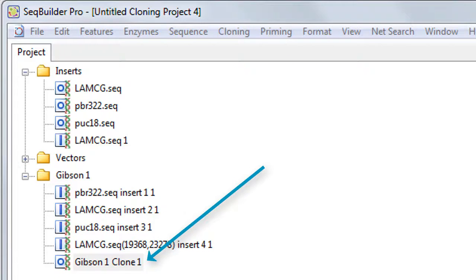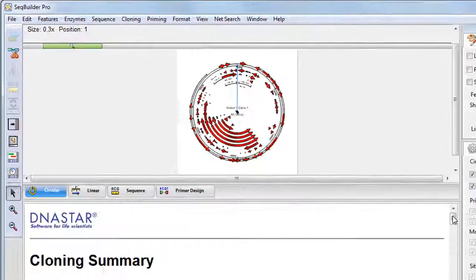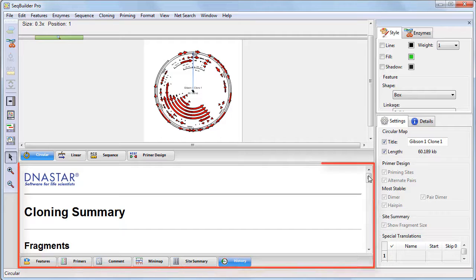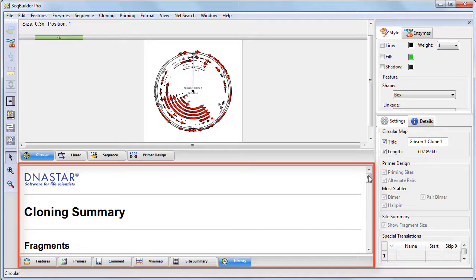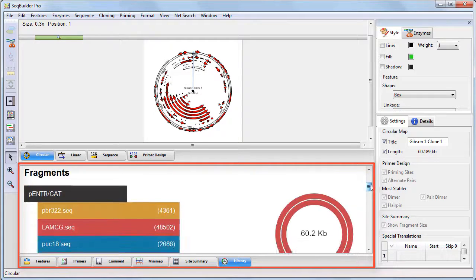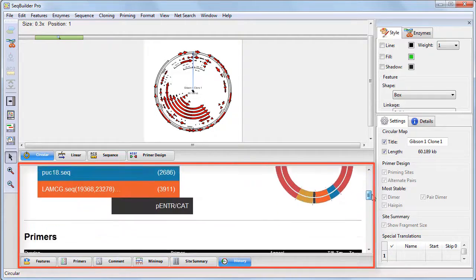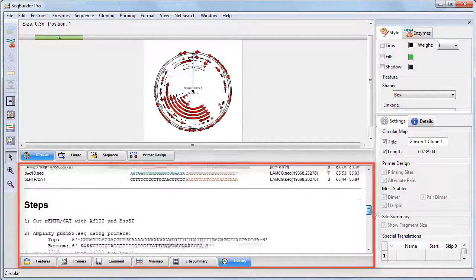Double-click on any file to open it in the document window. The History view at the bottom displays the same information seen earlier during the cloning procedure. This information can be saved or copied.